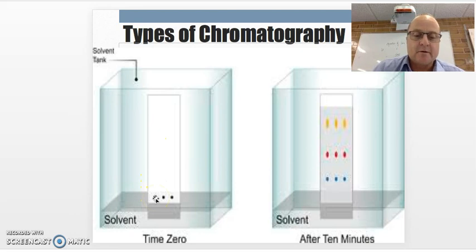Now, in this diagram, the mixture is these little dots here. So there's three samples of the mixture here: 1, 2, 3. Essentially, just three little drops of the mixture have been put on this plate. The mobile phase will carry that mixture with it. Now, how polar the different components of this mixture are, in these three different samples, will determine where each component will attach and separate out of the mixture.